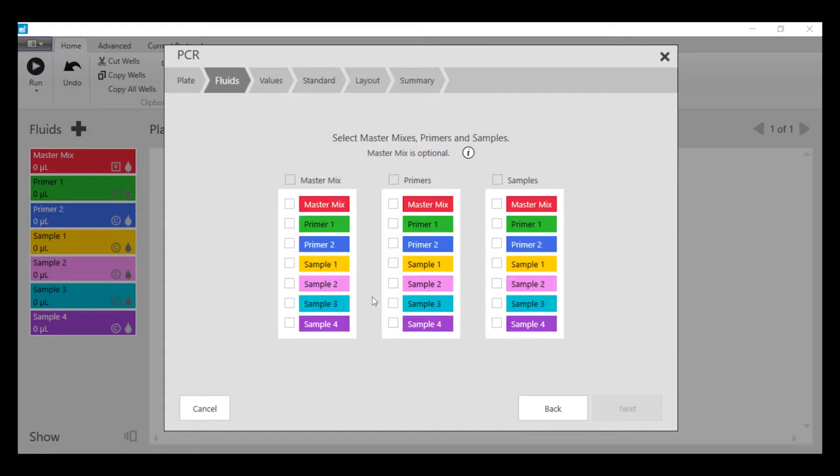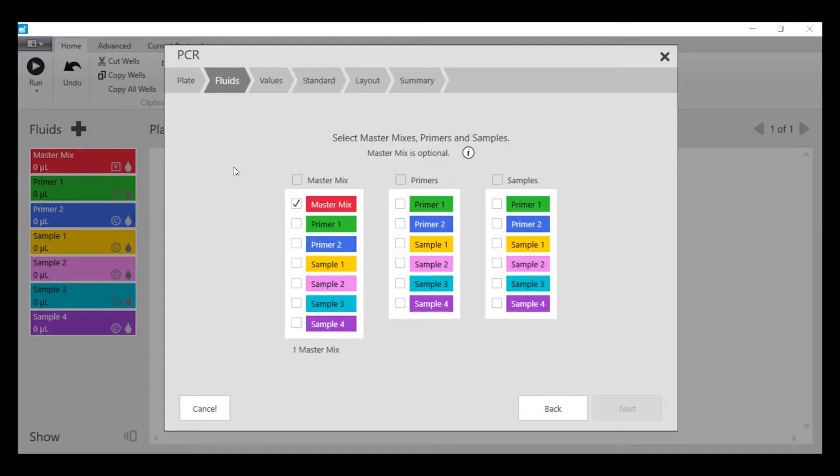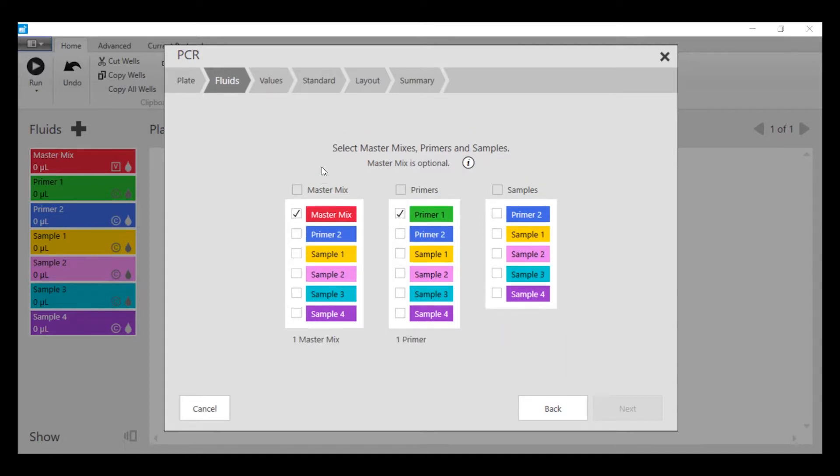We're going to select which fluids we're going to use for each type of material. One master mix, two primers, and the rest of the fluid samples.